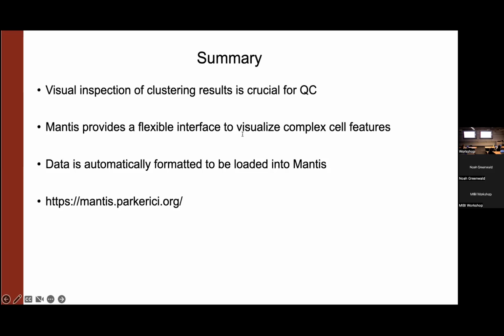Okay, there's a question about large images in Mantis. For us, this doesn't really come up since we don't do large images. I think it's either on the roadmap or currently happening that they're doing a pyramidal representation, so you can have very large images and then it'll zoom in just on part of it. But that would be a question for the Mantis people. The max right now is like 10,000 by 10,000.